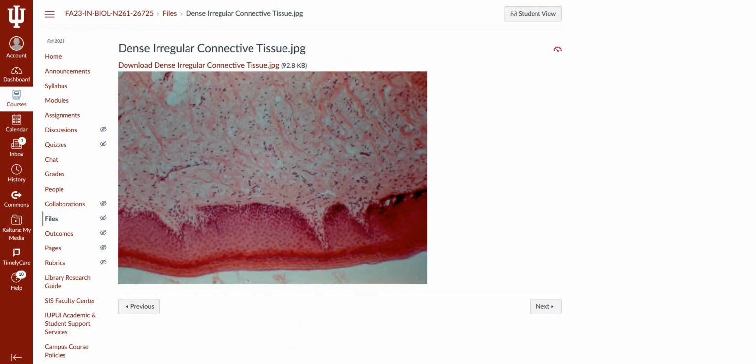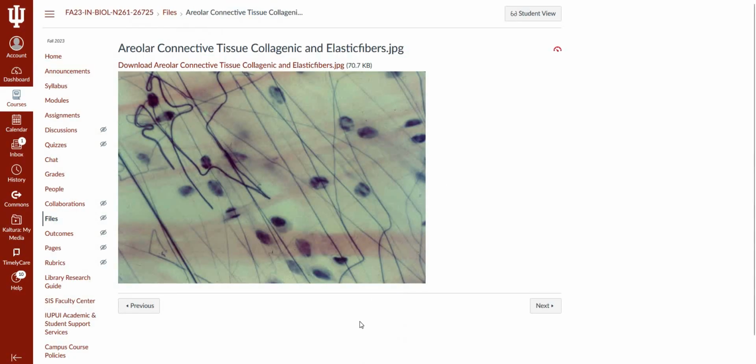So we're looking for really thick collagen fibers, and then those thinner guys. And you may also see some elastic connective tissue running through here. So I like this slide a lot because it shows all three of these types of tissue that you'll see in loose connective tissue.